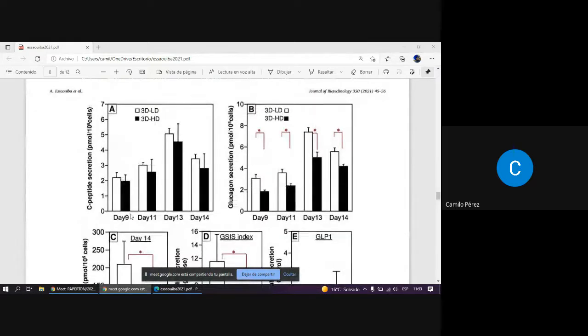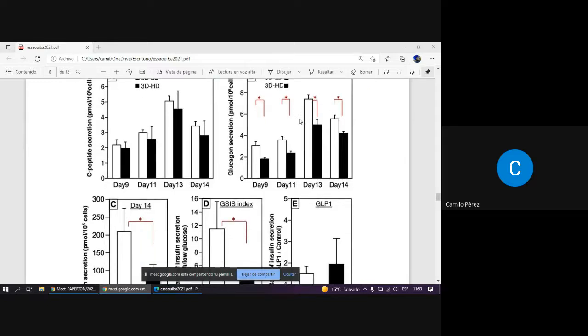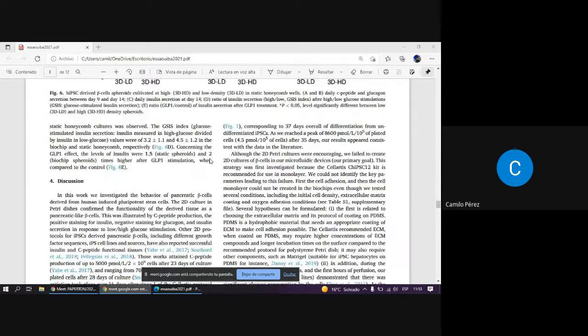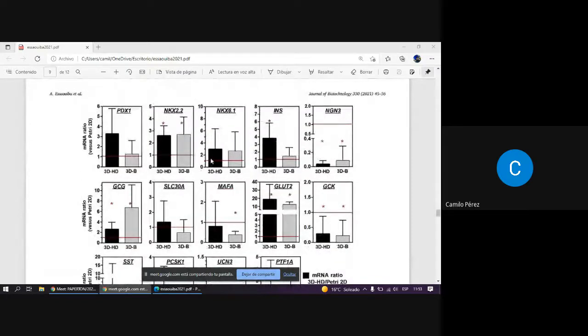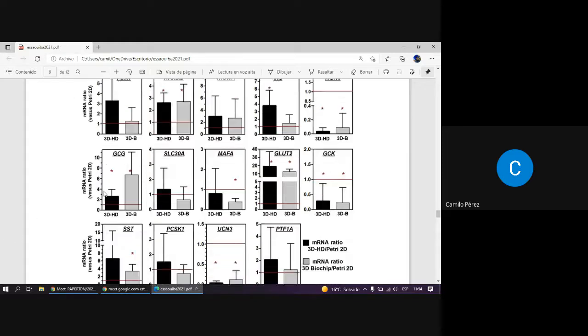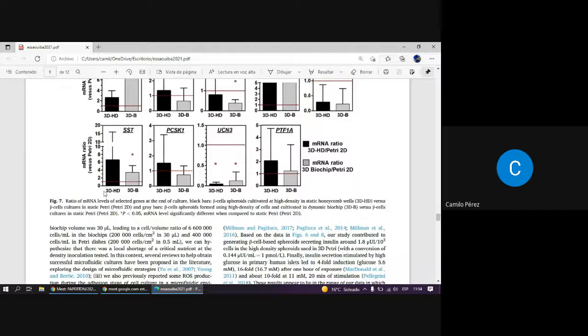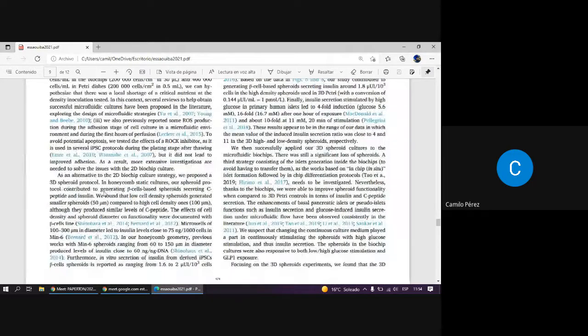After that, they compare different dates and compare the two strategies, with only microfluidics use, and you can see here the best performance in secretion of insulin, and it is very important because afterwards they propose a similar strategy to take cells from one patient and study the reaction and insulin resistance and drug resistance. This tool is very important for future analysis of patients.